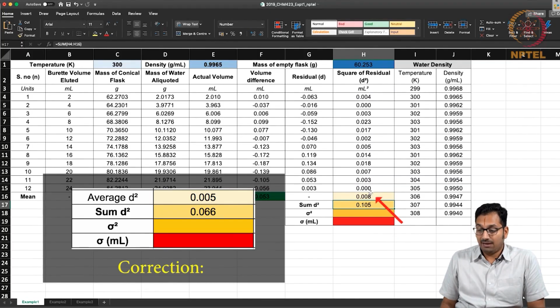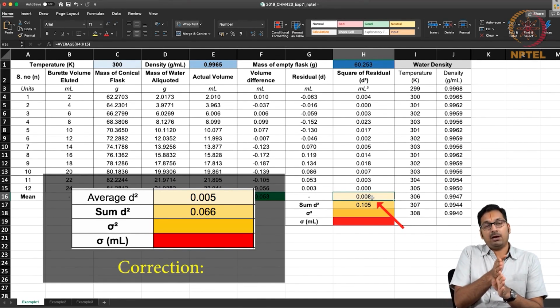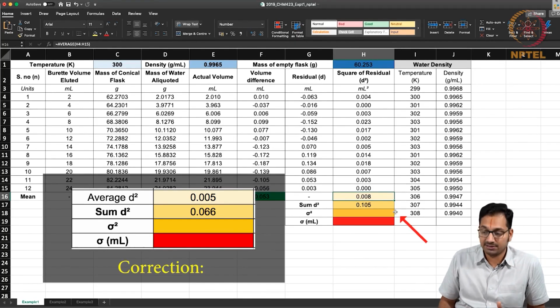You see in this case the average of the residual nicely falls very close to 0. This indicates that, for every measurement from the average measurement, you nicely have an equal number of points above the average and below the average, and the magnitude of this value being small indicates that you do not have large errors that have come up.